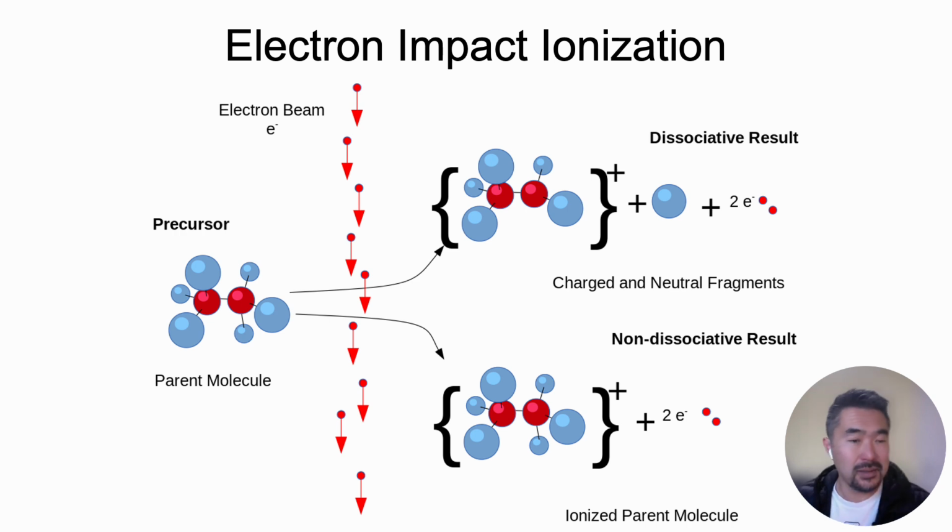Now, here's the electron beam that the molecule passes through that we just talked about, electron impact. Because this is negatively charged, and remember, each of these bonds and lone pairs and whatnot are made of electrons, some of those electrons can get knocked out of the molecular orbital as a result. Sometimes that results in knocking off a hydrogen or some fragment of the molecule at the same time.